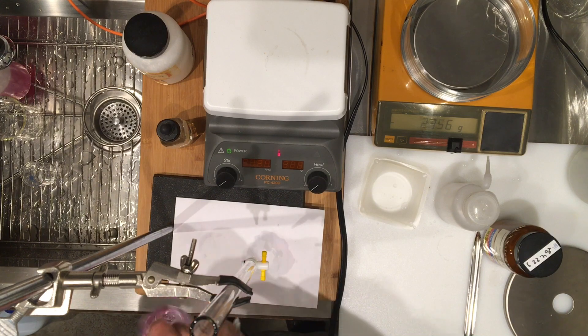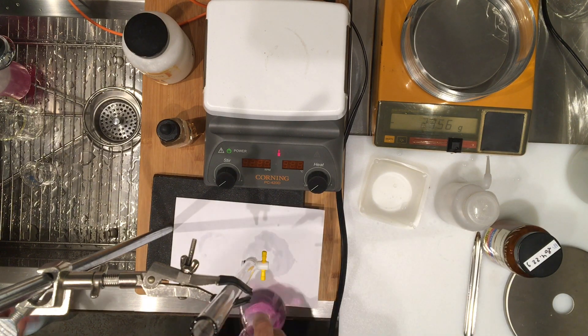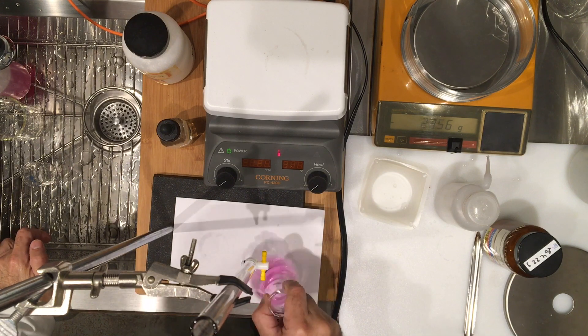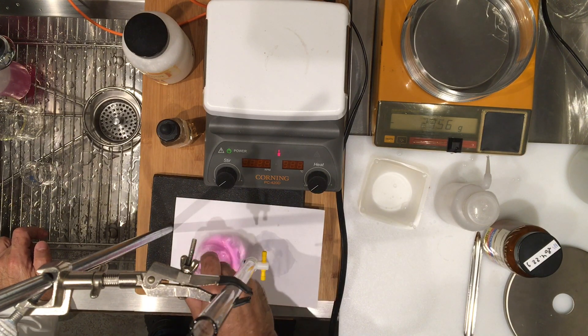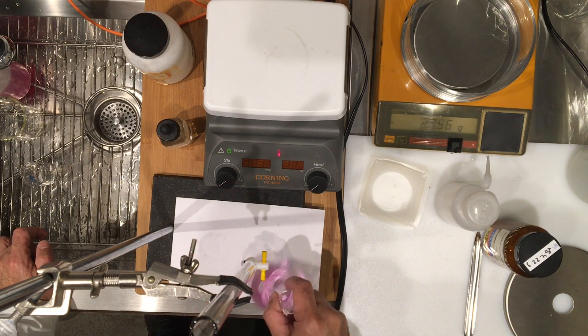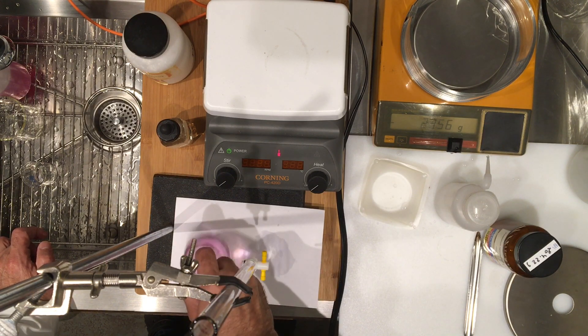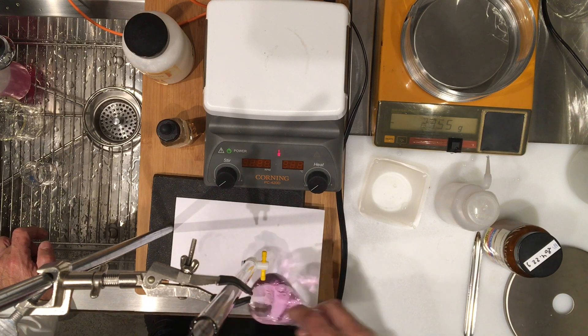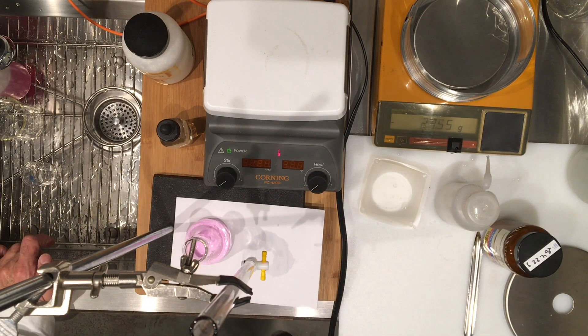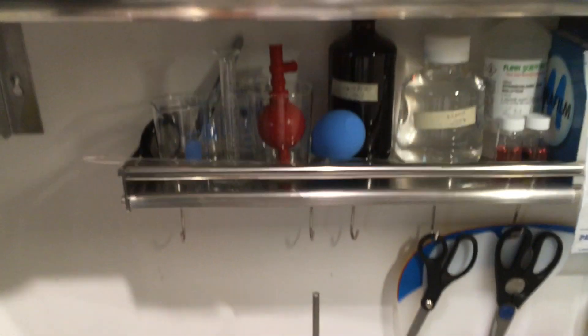Looks like I have it, because I don't see any KHP in here, at least not visibly. But let's go ahead and mix just to make sure — if the color stays on, then we have it. It looks good! We've got our pink, so let's go ahead and record this volume. I'm going to bring the camera down to the level of the readout, so please record this.